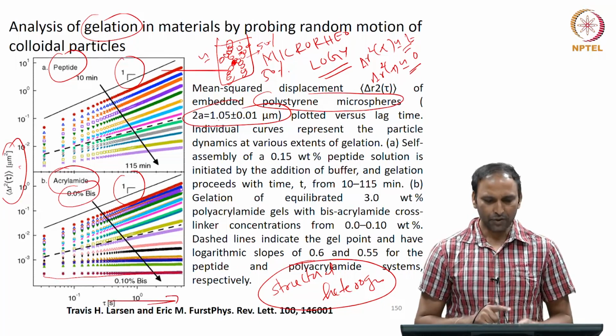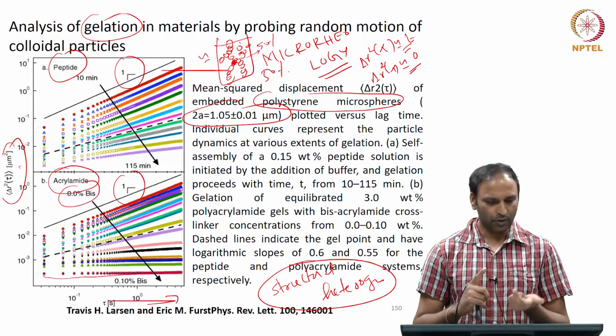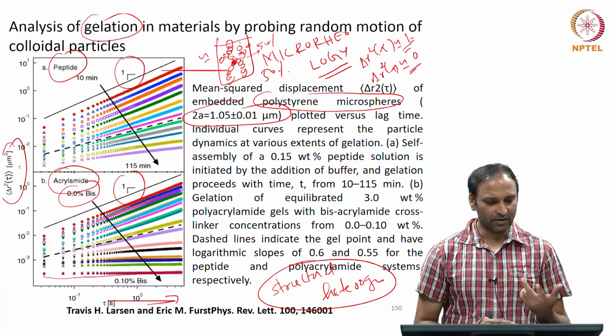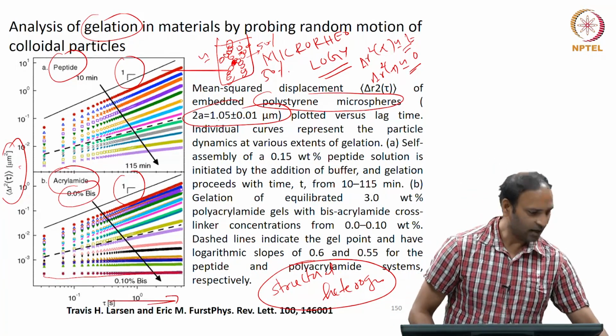You could use it for studying particle size. You can do an experiment like this where I can infer something about gelation time or the dynamics leading to gelation and things like that. So, maybe with that I will stop here.